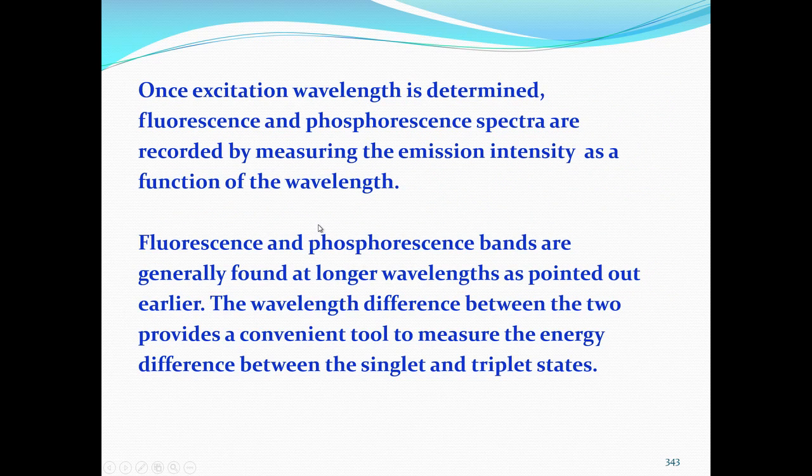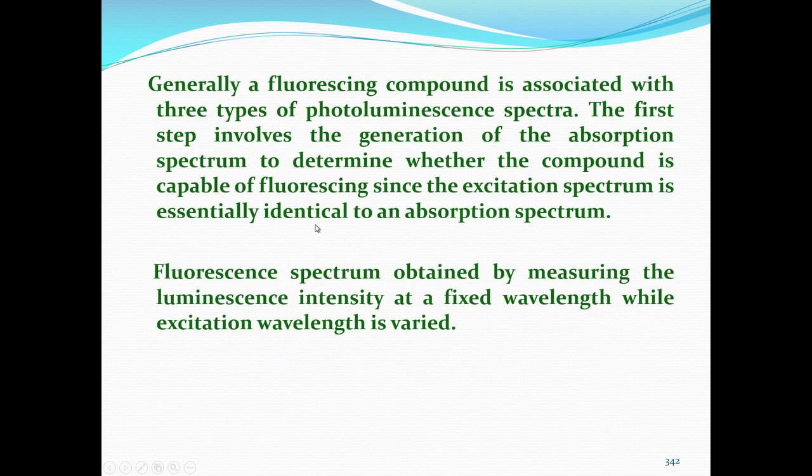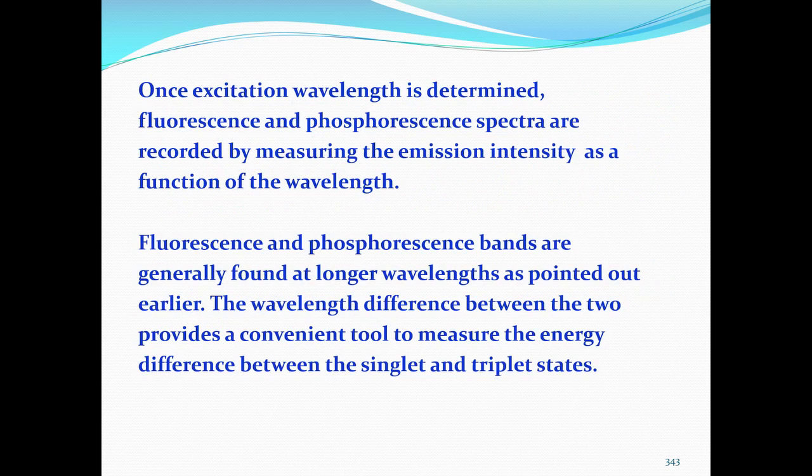So, once the excitation wavelength is fixed, then I can determine the emission, fluorescence or phosphorescence spectra by recording the emission intensity as a function of wavelength.